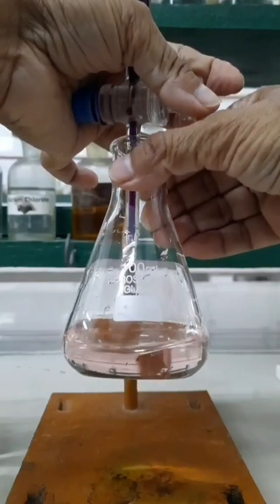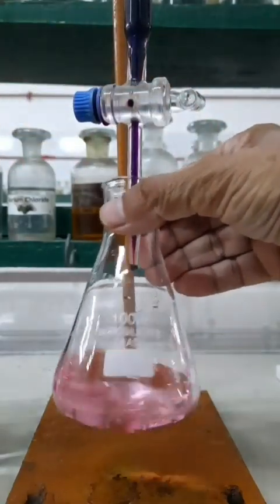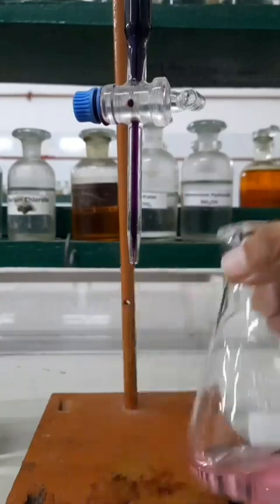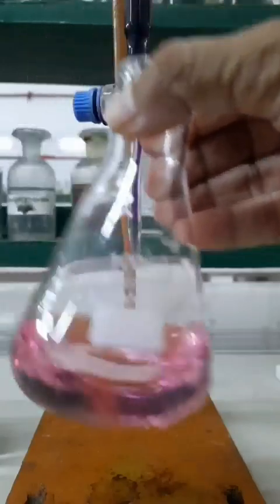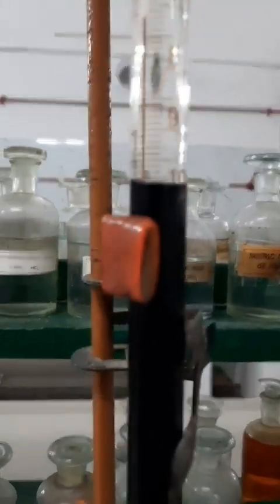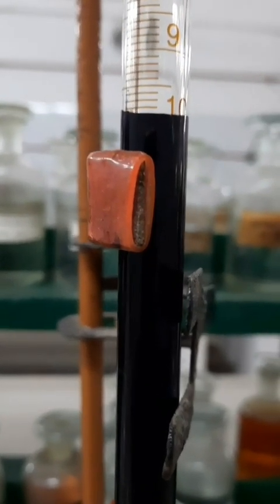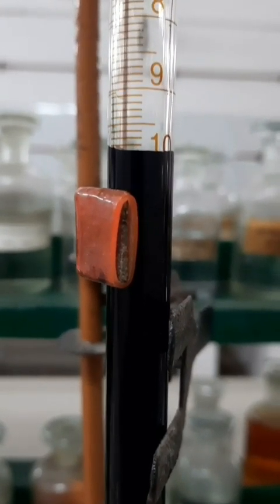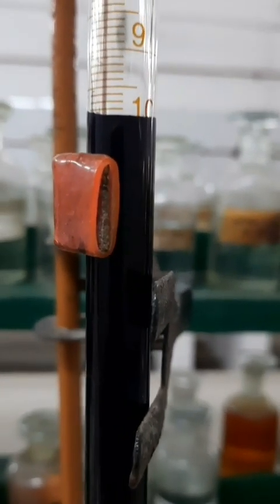Now here you can see that after transferring just 1 drop of the liquid, the color changes from colorless to pink, and this will be the exact endpoint of the solution. You have to record the reading here on the burette. That is the final reading. Now you can see that the reading comes out to be 9.9 ml. Initially we got 10 ml as the endpoint, and this second time we get the reading as 9.9 ml.